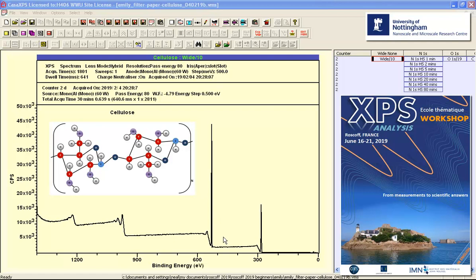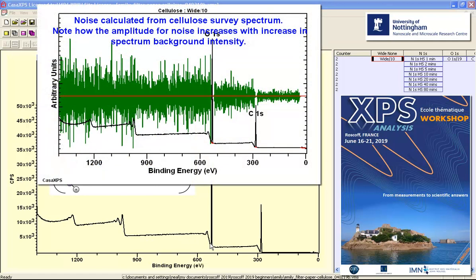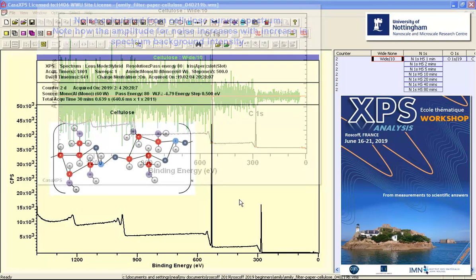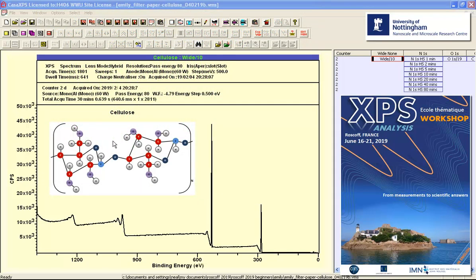The ability of XPS to measure a small peak is a function of both the sample itself and also the acquisition conditions. The acquisition conditions determine the sensitivity for the instrument and therefore the signal and noise that we would expect. For pulse counted data you expect the noise to be the square root of the counts per bin. So if the counts are high then the noise is relatively high so this can have an influence on whether we can identify a small nitrogen peak especially when we have a step here that follows this carbon 1S.